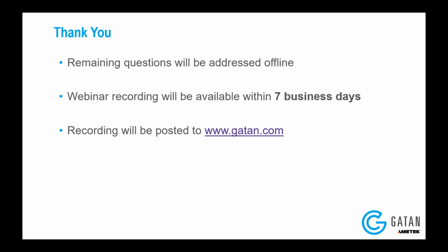The second thing is that the ClearView has this HDR readout on the sensor to improve the dynamic range. So the ClearView dynamic range will be much better than the OneView dynamic range. And then, of course, the maximum frame rate on the ClearView is much higher than the OneView, and that makes it better for, as I was showing, 4D STEM, but also in situ.